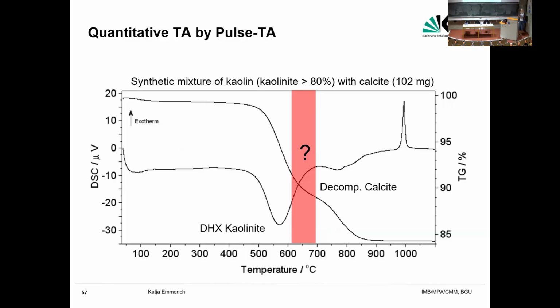If you compare those data with, for instance, Rietveld analysis quantification of a complex sample, thermal analysis would give you, most of the time, the maximum content. If thermal analysis tells you your sample contains maximum 10% of calcium carbonate, and your Rietveld analysis gives you 15%, then you have to think about the structures you used for Rietveld analysis and go back to your quantification by XRD.